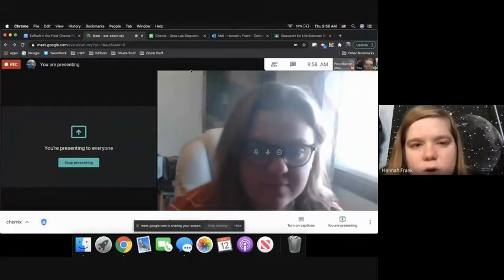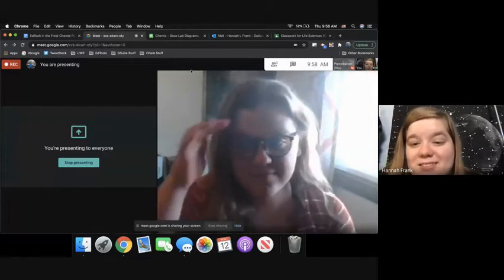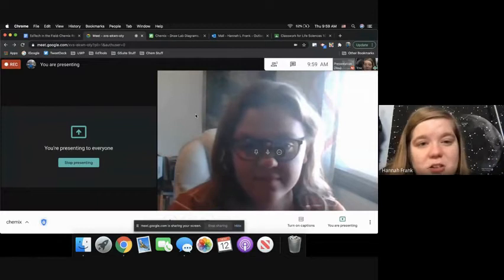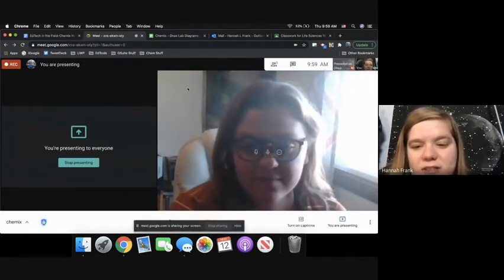Alrighty. So, Riva, today I'm going to be teaching you how to use Chemix, which is an online lab drawing software. So before we start, do you have any experience using Chemix at all or no?